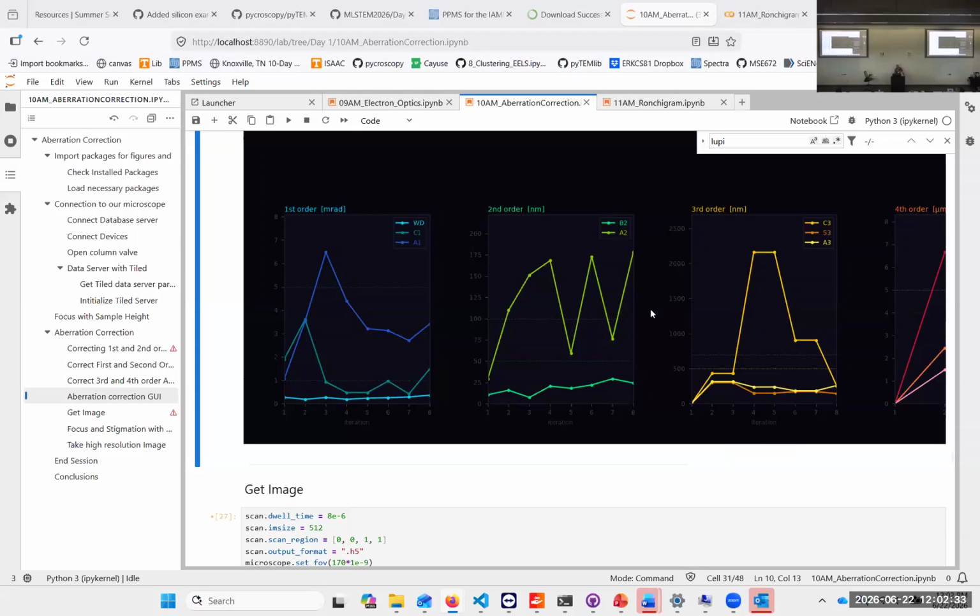If your microscope is not super well set up, and this aberration measurement is always to be taken with an error. So if you correct always A1 with 100% in the initial correction, then you will get an oscillation that will go down slowly, hopefully.